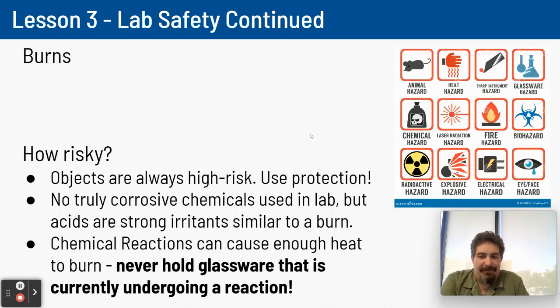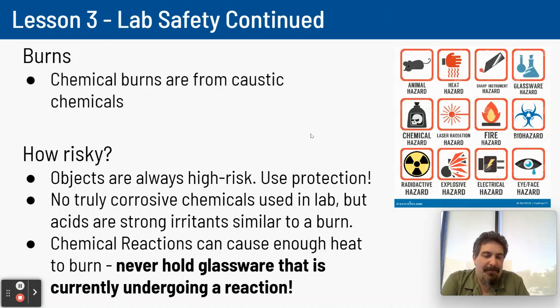Now, we're talking about burns. Try to ignore the bottom. Chemical burns come from caustic chemicals. The chemical itself, like an acid, irritates your skin or burns your skin if it's really strong just from touching it.